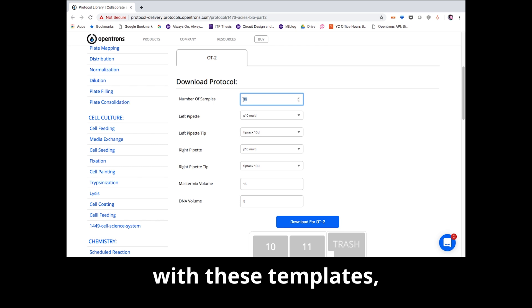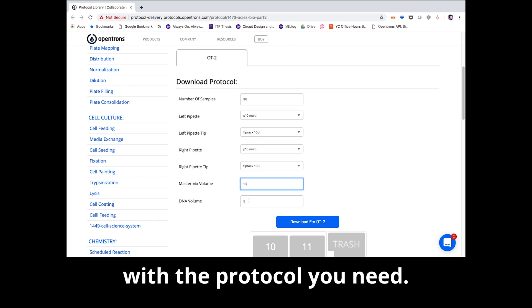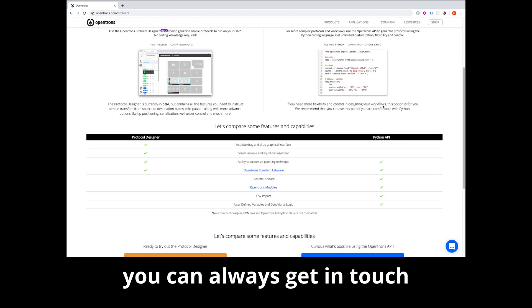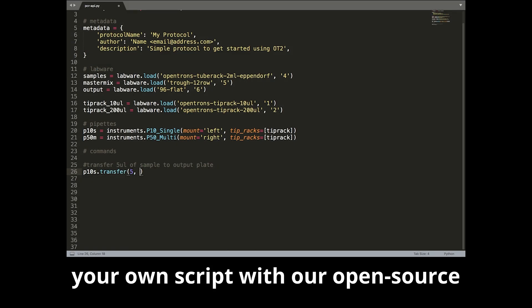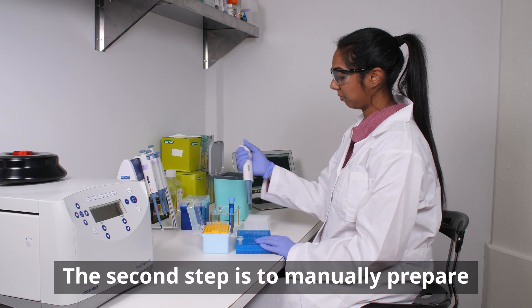If your requirements line up with these templates, you can quickly get up and running with the protocol you need. If you need help making a protocol that exactly fits your specifications, you can always get in touch with our protocol development team to create a custom protocol for you. Additionally, you can always write your own script with our open source Python API if you wish.